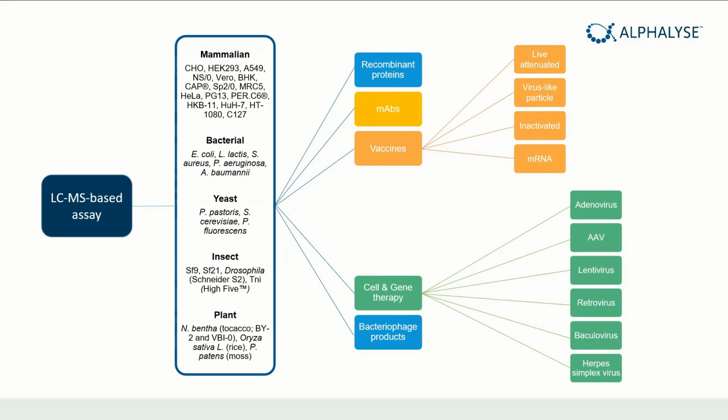So it's the same generic method that has been applied to all these different types of drugs. It has also been applied to different process samples, from the early harvest sample to the most purified drug substance.